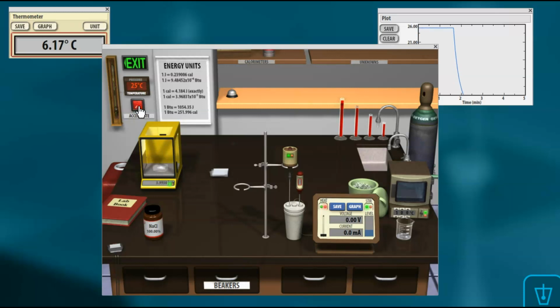Okay. Another thing that you need to do is the lab notebook. This is the lab notebook. Okay. And this is when you're done with everything, clean up lab bench. This is the clean up lab bench. This is for disposing all the samples. All right.